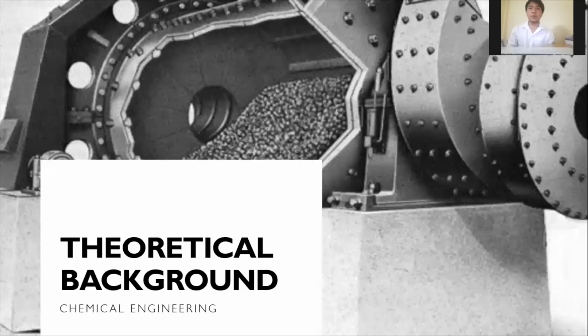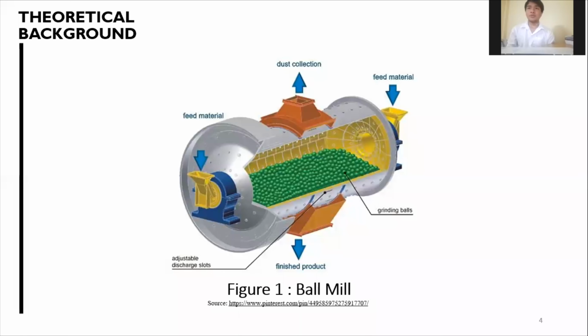As for the theory, the ball mill consists of a grinding pot that rotates slowly and horizontally in a closed system, in which the grinder has balls inside. Grinding uses the principle of impact of the ball with the particle. When the grinding pot begins to rotate, the ball moves up the wall of the pot and falls down.